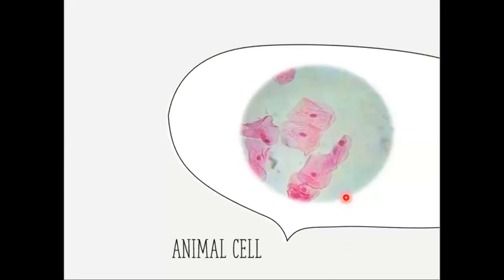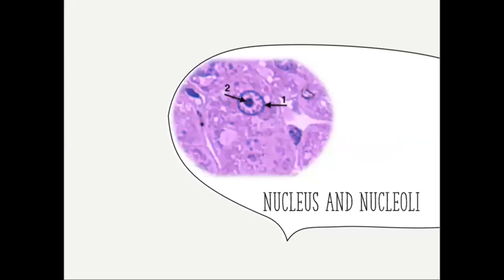This shows an animal cell in higher magnification under the light microscope. What we can clearly see is the nucleus as a central dot and the surrounding cytoplasm. The cell membrane is not visible, but with the margin of the cell cytoplasm, we can outline the cell membrane. In addition to the nucleus, we can also see the nucleolus in some cells. Also, granules can be seen, and the mitochondria, of course, but not very commonly.